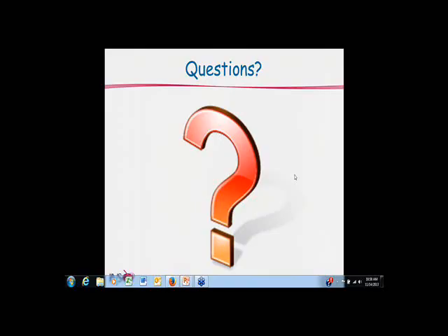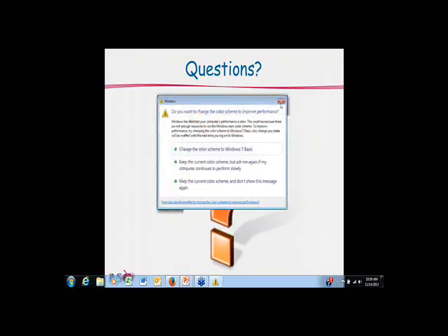Okay, the next question starts by thanking all of our presenters for very interesting information. And the question is, what is the availability of these tests? By that I mean, who is actually providing these testing services? I'll take that one. So IIVS, we function as a research service organization, and we do perform the keratinosens assay for clients. We're in the process of adopting the direct peptide reactivity assay, so we're hoping to have that one available commercially soon.